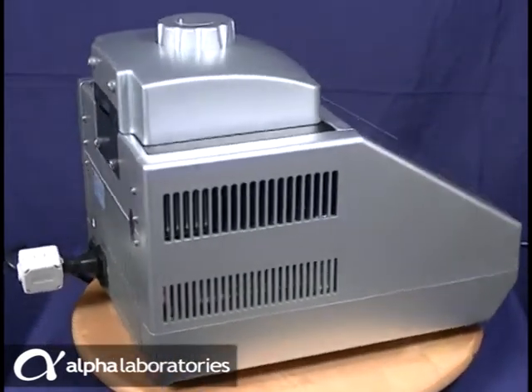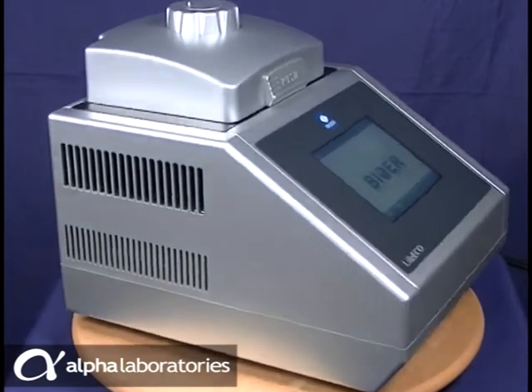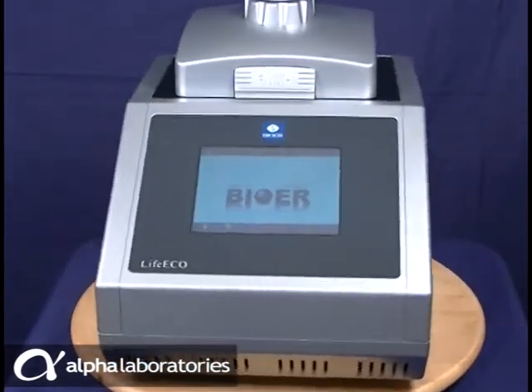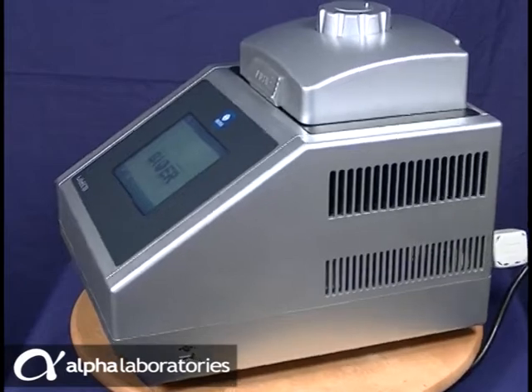A software CD is provided to enable the Life Eco to be run through a network or from a PC and for creating and editing PCR protocols.